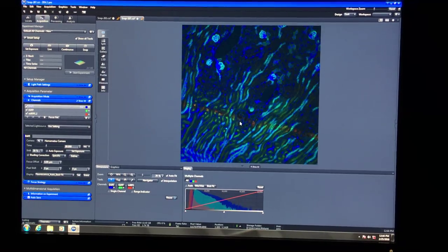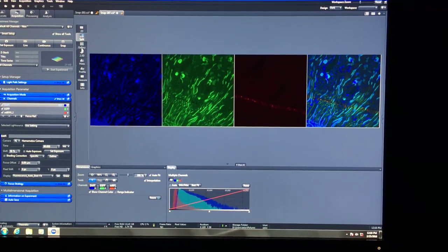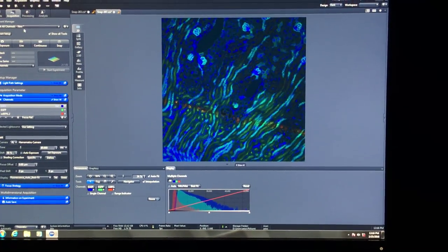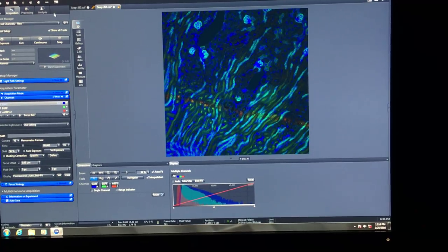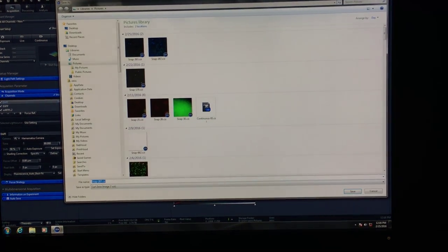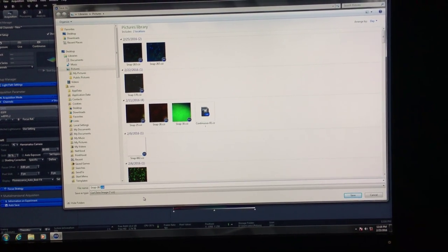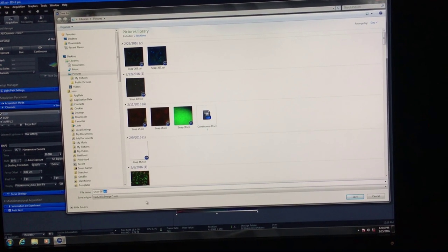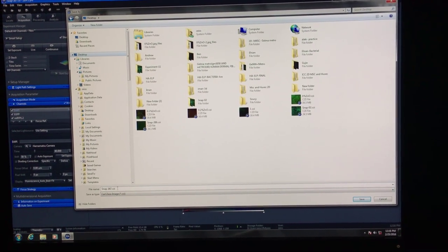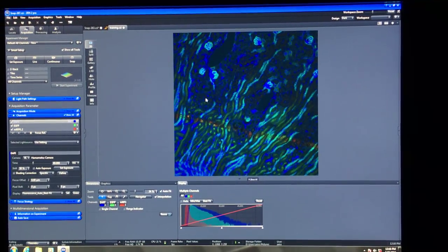Once you've acquired those images, you can split them into different channels. The important thing is knowing how to save the image. Rule number one: I would recommend always saving it as a .czi file first because it contains everything—your metadata, your original data, everything—in one file. Save it as 'training,' for example.